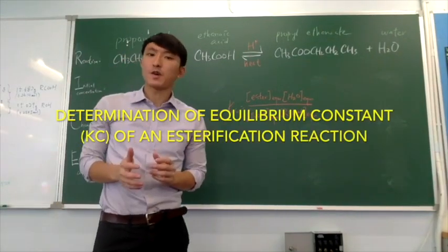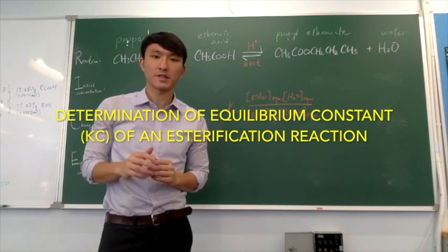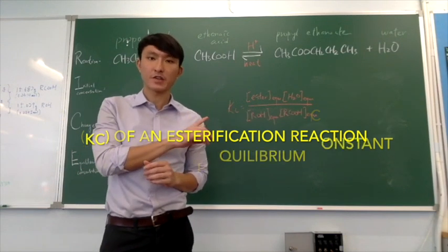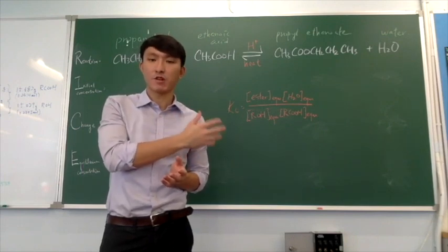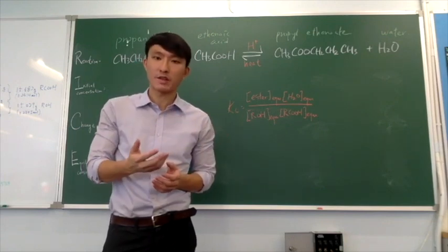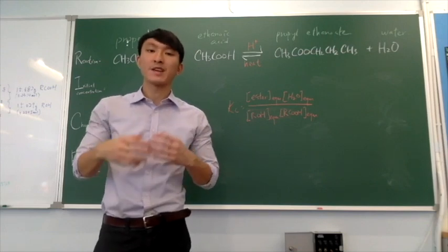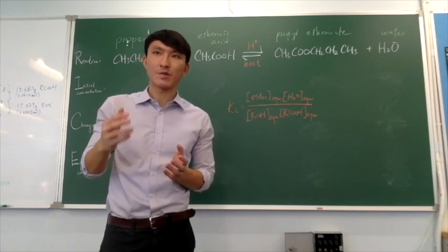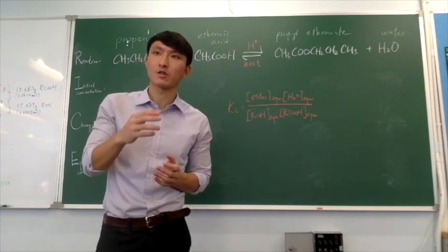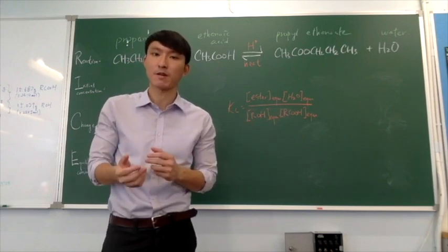Hi, in this video we are going to discuss the experiments to determine the equilibrium constant Kc of an esterification reaction. So I'm going to first talk about some background knowledge of how to work out the equilibrium constant as well as this reversible reaction, and then we will talk about some experimental procedures, and I will give you a demonstration and also tell you some things you have to pay attention to in order to have a successful experiment.